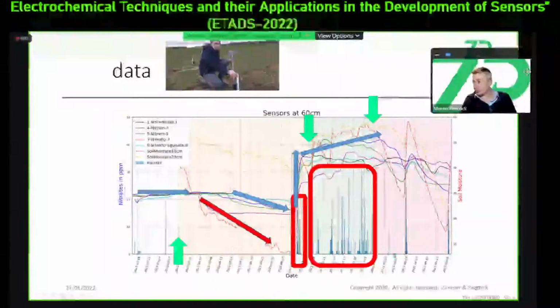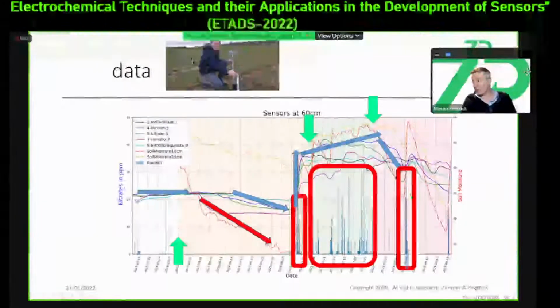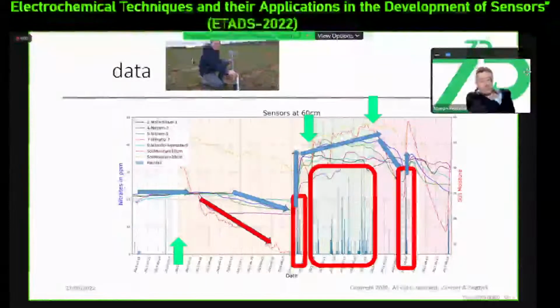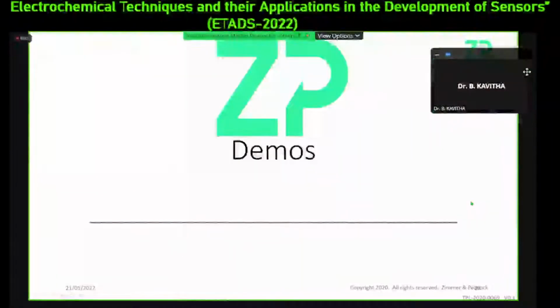So suddenly you see this along here, we've got these blue spikes that indicate the rainfall. There is no rainfall. The ground dries up, and then it rains a bit more, and then the nitrate goes up. There's estimations that in the world, maybe 66% of the nitrates that are put onto farms are actually wasted, and this data absolutely defends that hypothesis that in fact there's a lot of wastage going on.